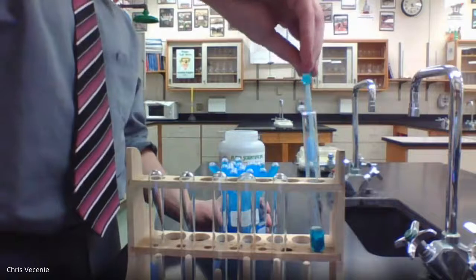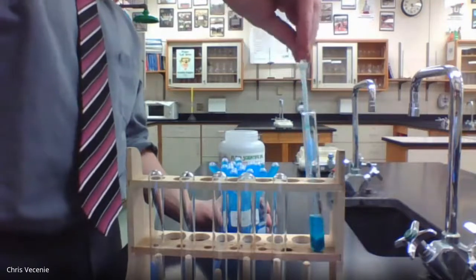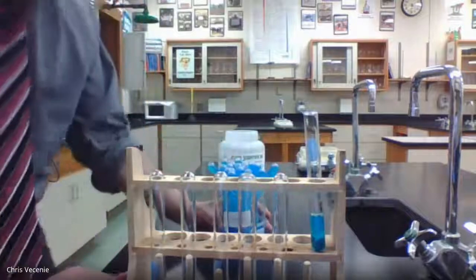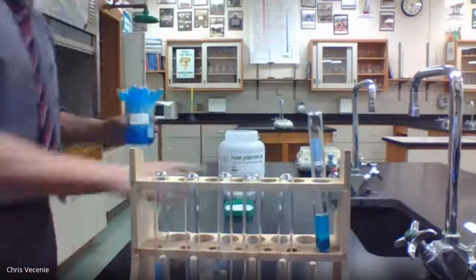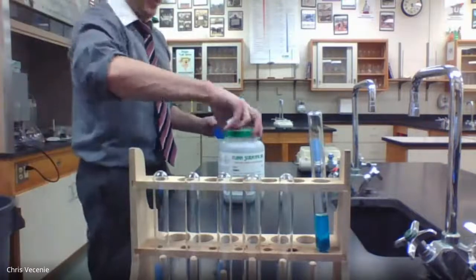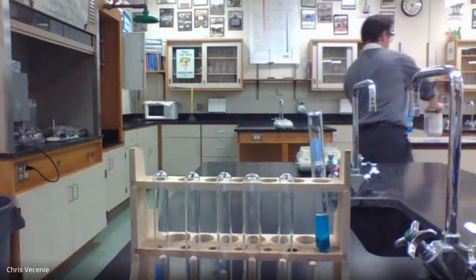Then I'm going to take a pipette of my copper II sulfate and add that in. I always have you do this one first because it takes the longest. So we're going to come observe that after we run all the other reactions. That one's going, but we can't observe it until the end.